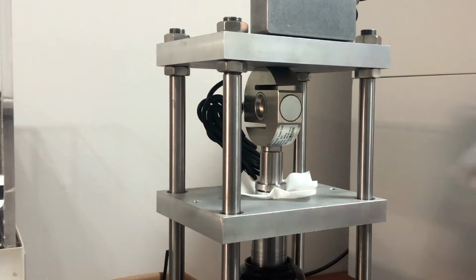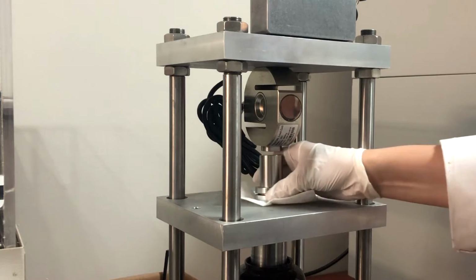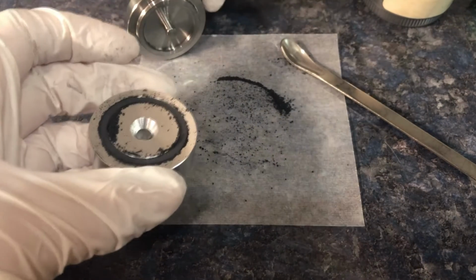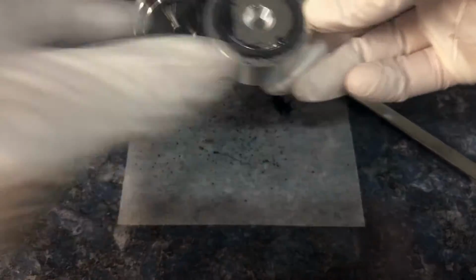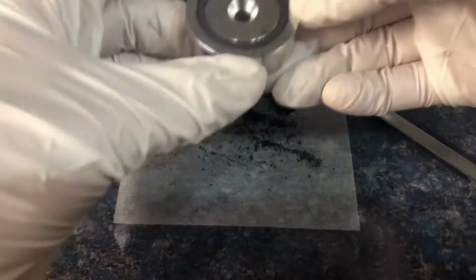Once you have successfully pressed your sample, loosen the jack and bring your die set to the workbench. We try to get the level of the compound so that it is fairly close to the level of the aluminum disc. If there is not enough sample, put more sample in and press it again.